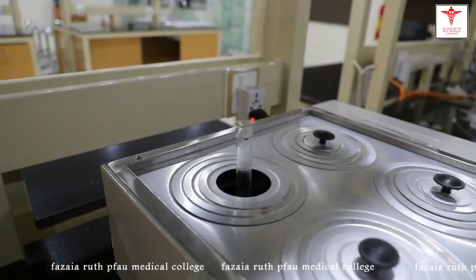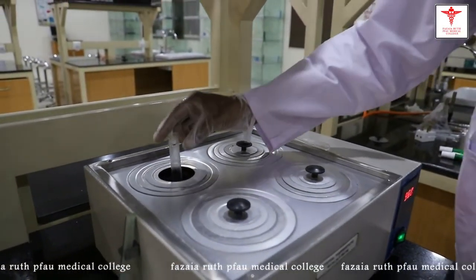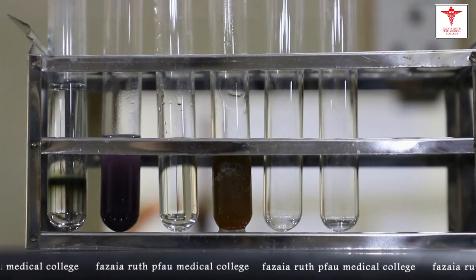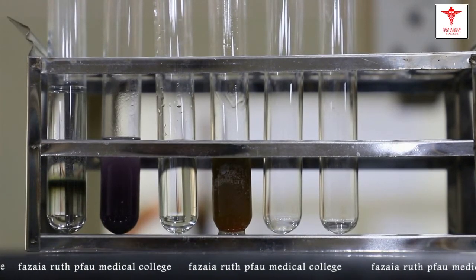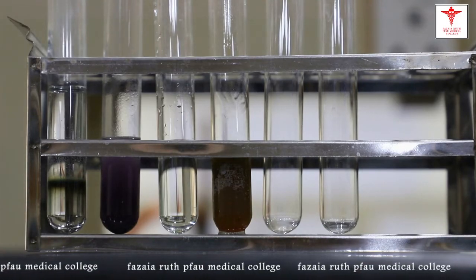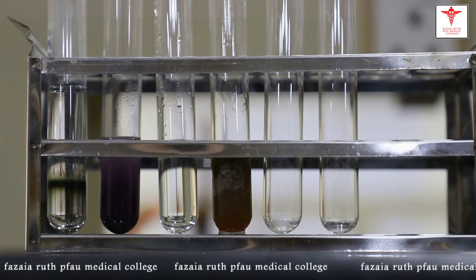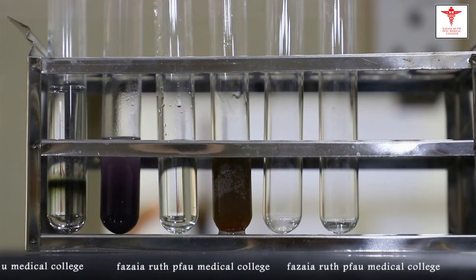Okay, after boiling it for 2 minutes in the water bath, now we'll see what changes have appeared. Now this is the observation for Benedict test. You can see in this test tube that red precipitates have appeared in it, which is showing a positive Benedict test, and these red precipitates are formed because of formation of cuprous oxide.